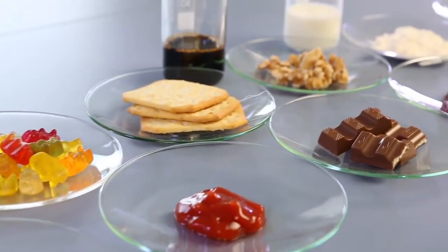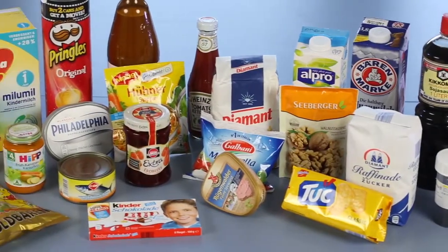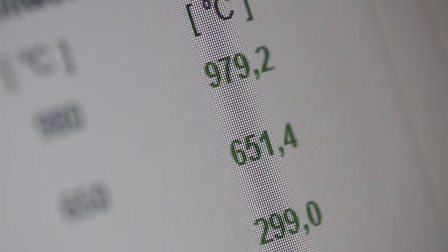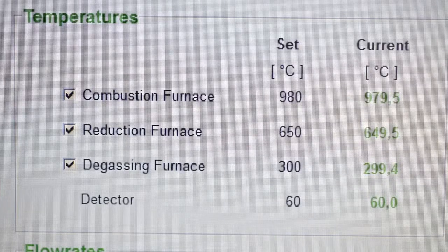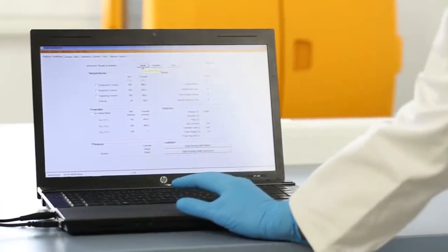Dumatham can be used for virtually all sample types and can be safely operated in all laboratories without the need for a fume hood. Gas flow, temperature, pressure, and valves are monitored automatically.